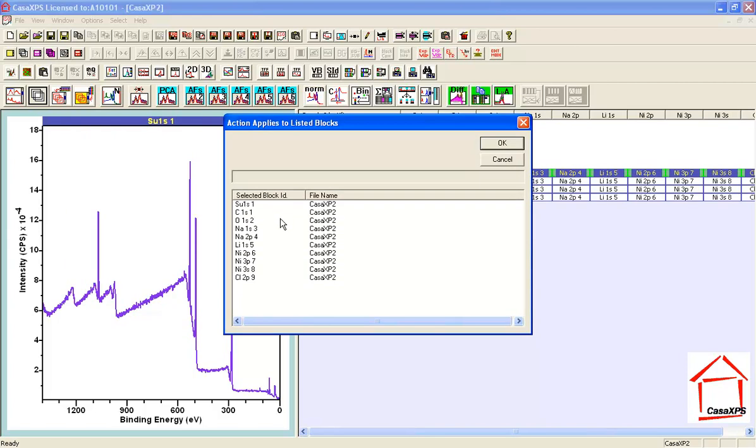So I've unticked the block ID, transition, and element options. So the only enabled option was the sample ID.